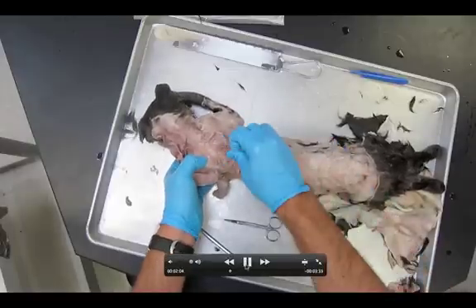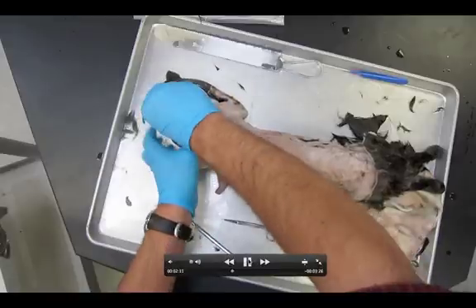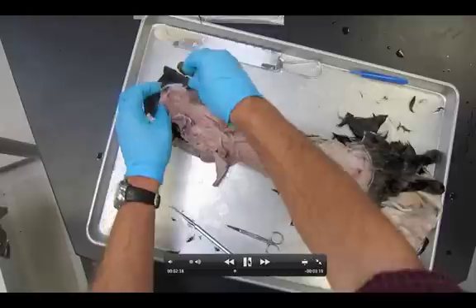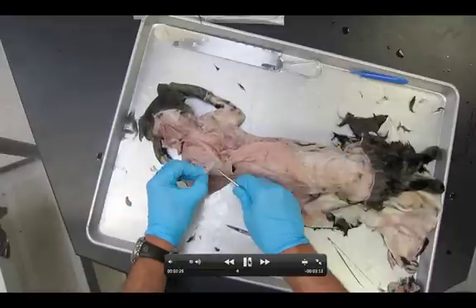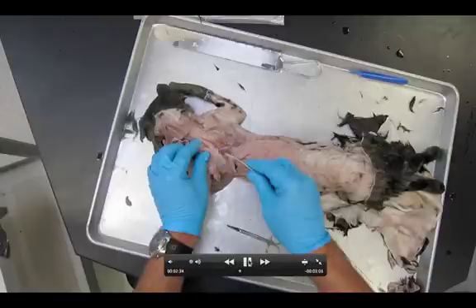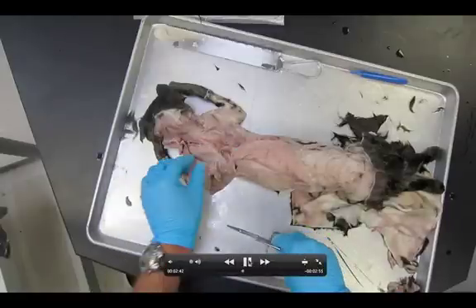Now let's take a look at the muscles we see here. Use your fingers and not the probe — you can really wreck these muscles with the probe. Just use your fingers to carefully clean up the connective tissue blocking the view. These are what we call the rhomboidus muscles, sometimes just called the rhomboids.